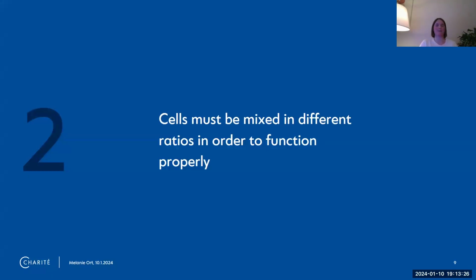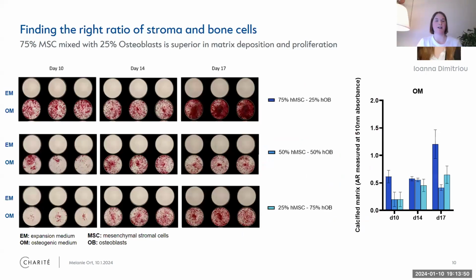So the next part is we were looking into how important it is to mix cell types and how they influence one another. Most of you that did something with cell biology know that cell-to-cell contact is quite important for how cells will behave later on. My colleague Annie did all of the work; this is just a small excerpt.